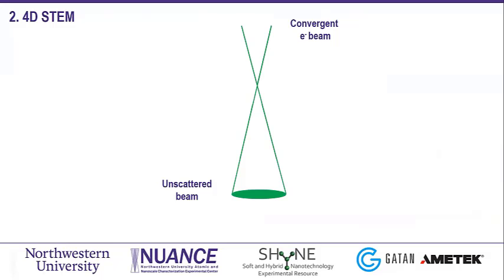So with that in mind, we can think about how to expand that, right? Most, I guess all, of the examples that I showed in the beginning were done in conventional mode, when you are in TEM mode in your microscope and you converge the beam and take the diffraction.